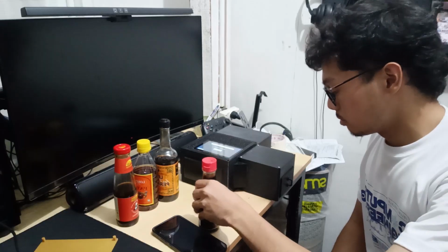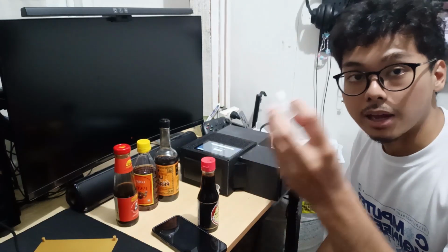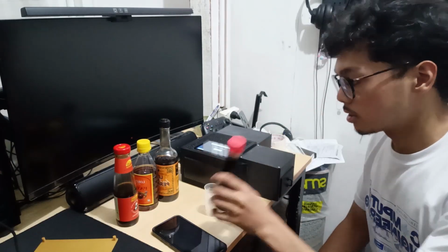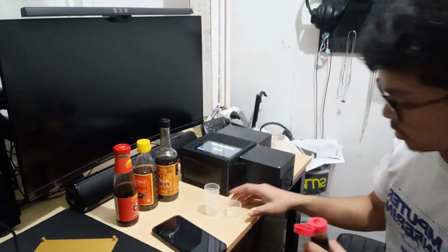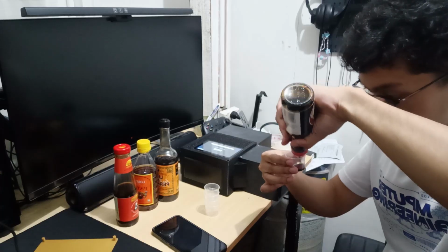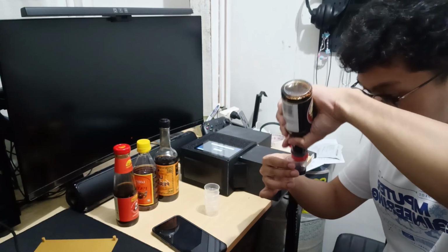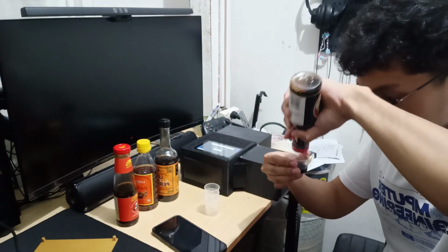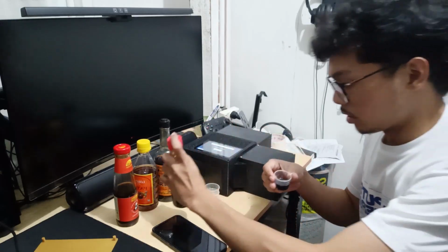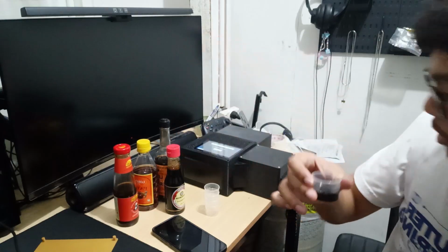So now I'm going to pour in this plastic cups 10 milliliter of soy sauce. 10 ml. Okay, so that is 10 ml. I don't know if you can see that.